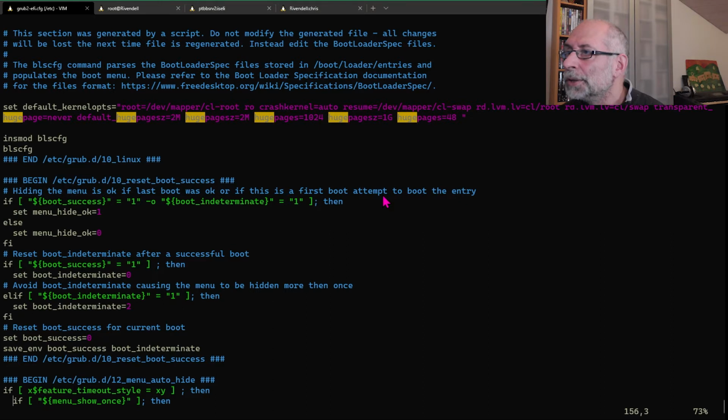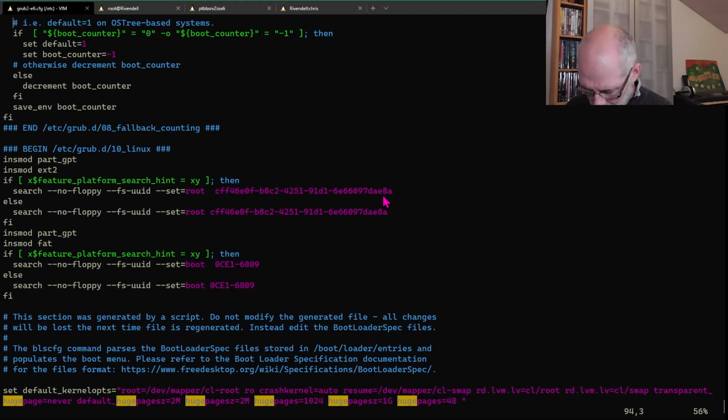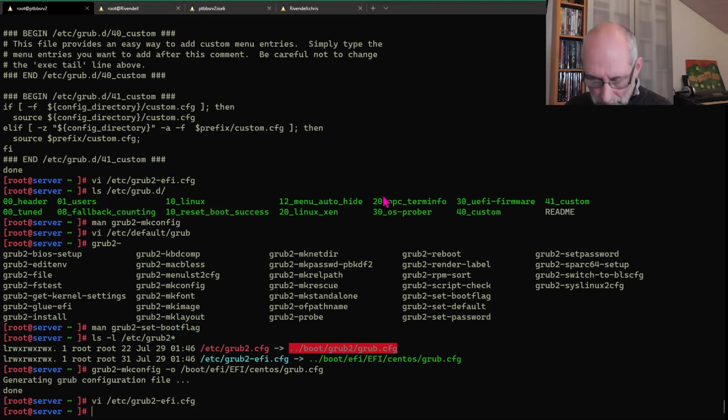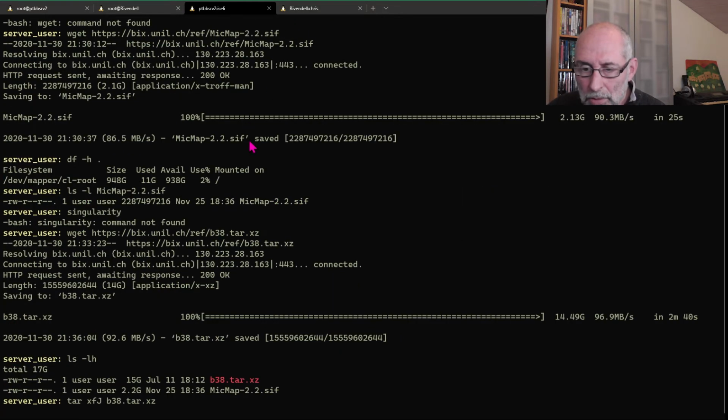There, better. Okay. So here, it's still going.